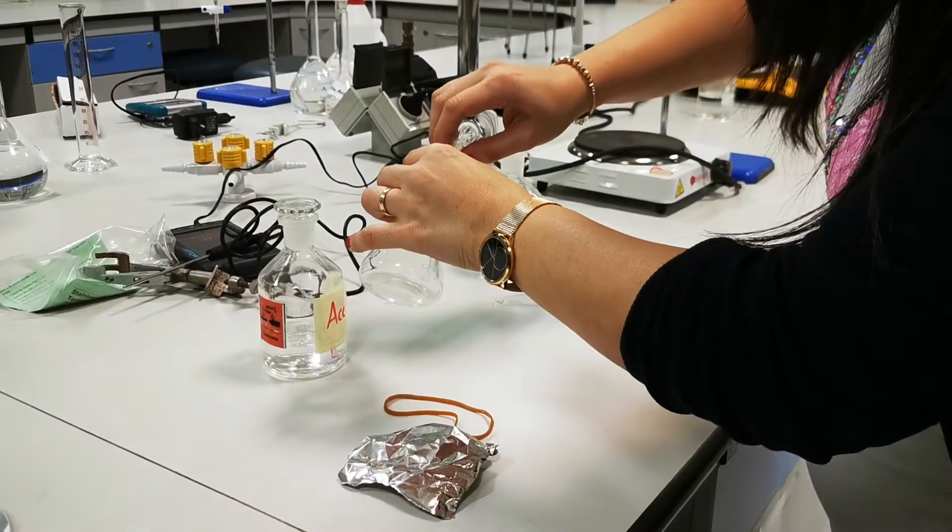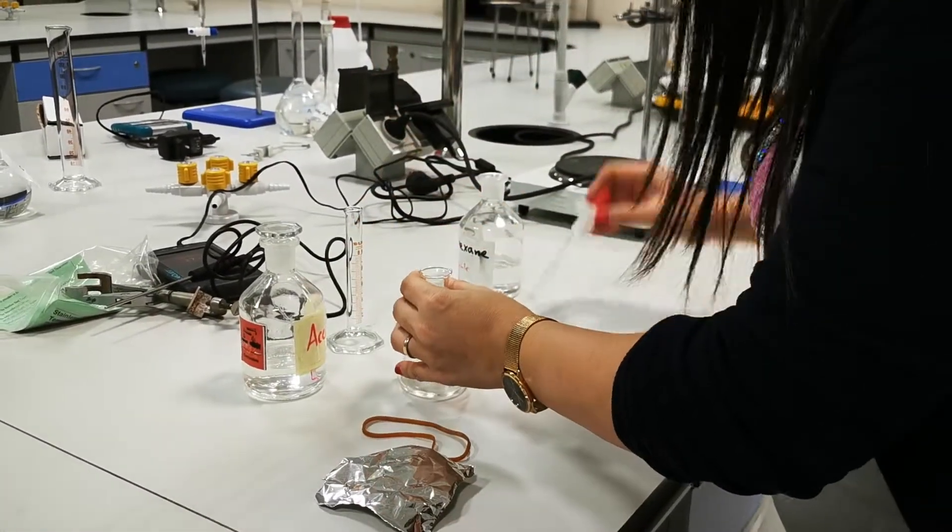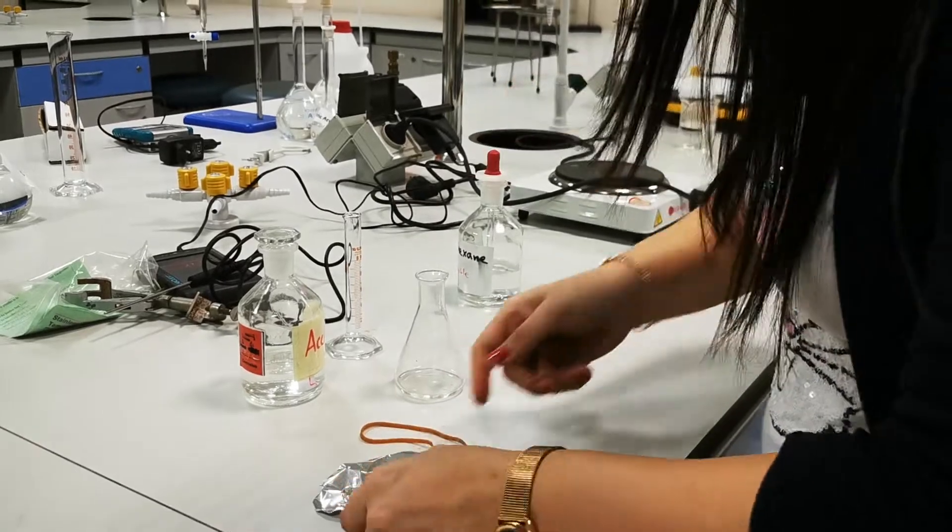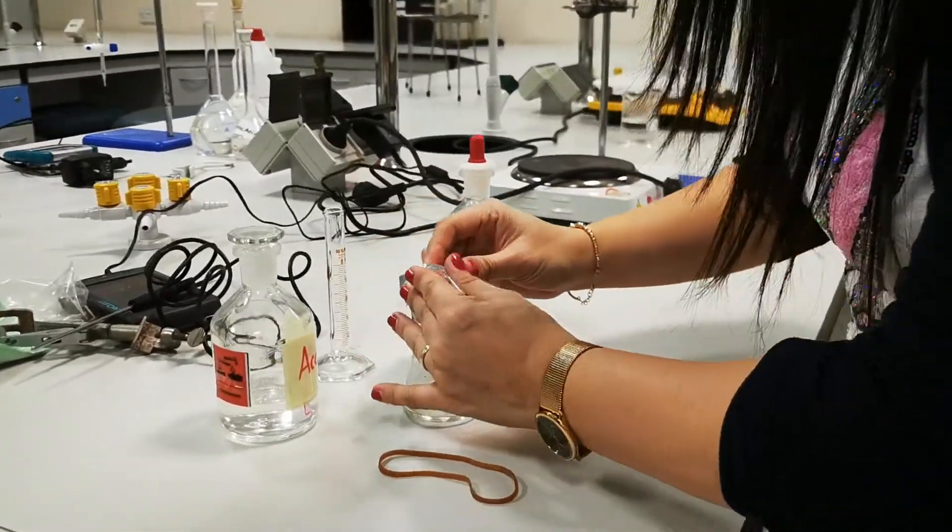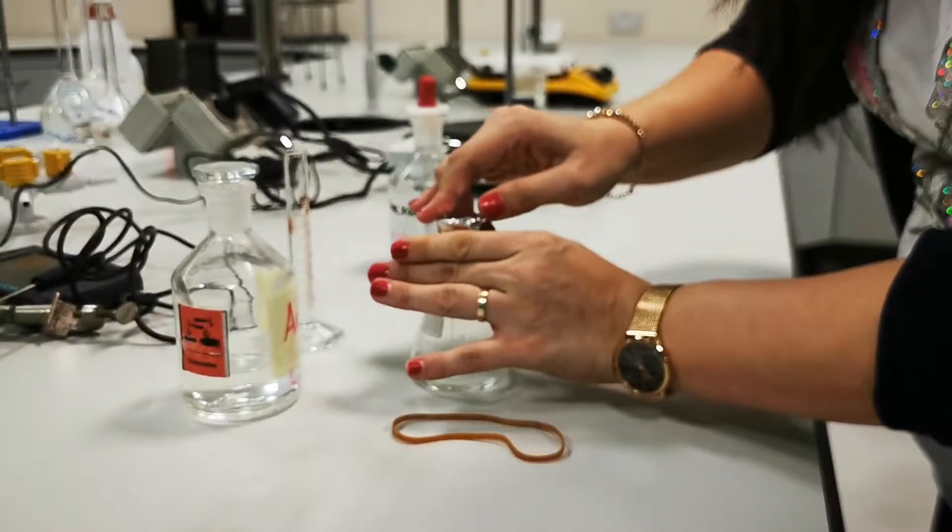I'll put it in the Erlenmeyer flask, and I will cover it with the aluminum foil, the one I measured the mass, and the rubber band.